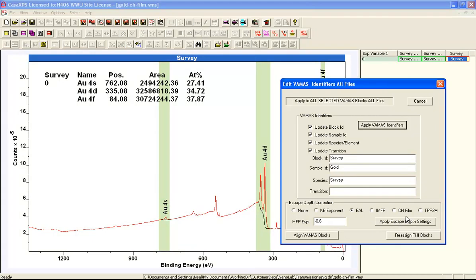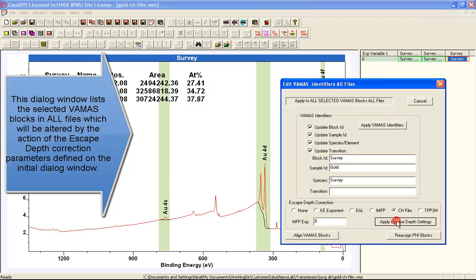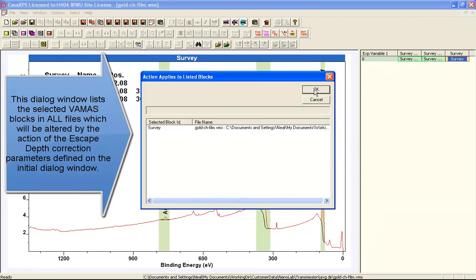And what I'm going to do is switch this from effective attenuation length to a correction that will be the effective attenuation length. It will also include a hydrocarbon film thickness. So we'll start off by just setting the film thickness to zero and say apply.